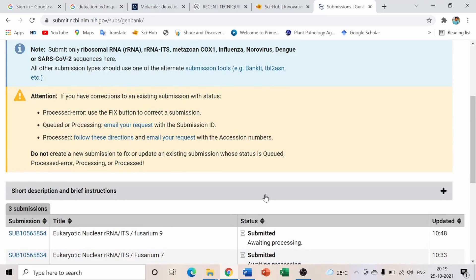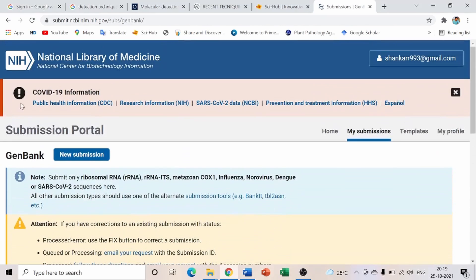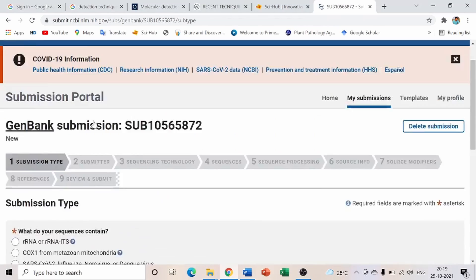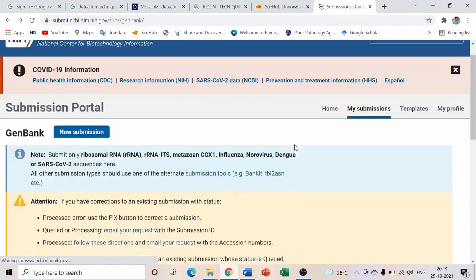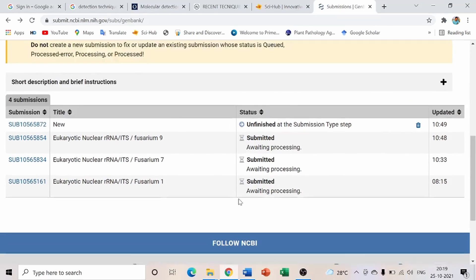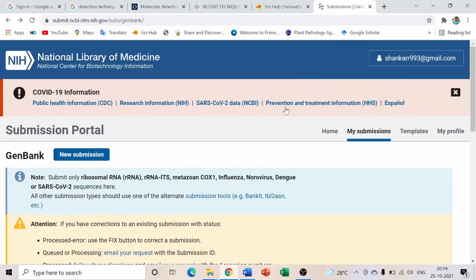This procedure is quite common for almost all fungal organisms — whether it is Fusarium, Rhizoctonia, or any other fungal culture. To submit another sequence, click New Submission and repeat the same process.